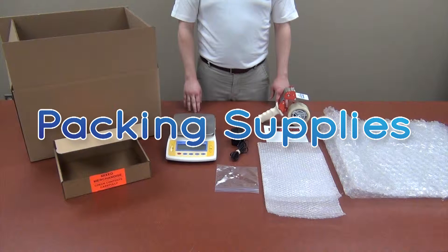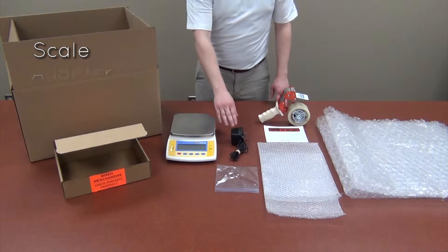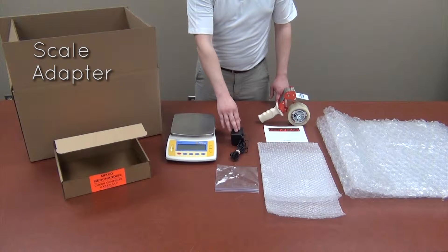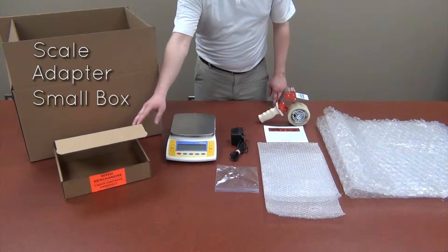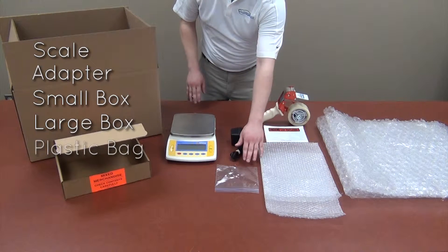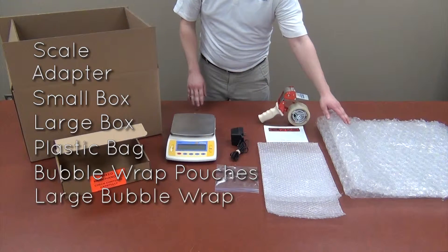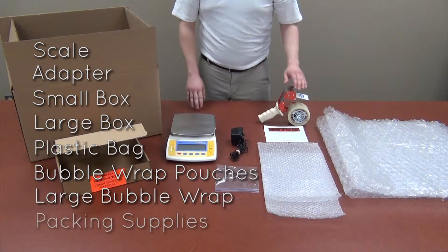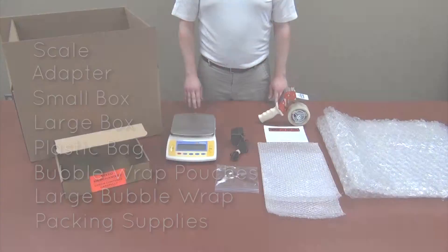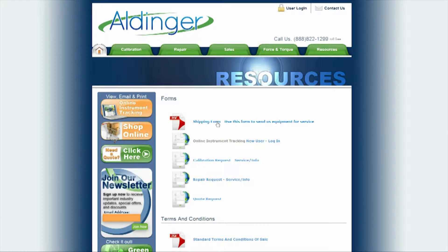To begin packing your scale, you will need the following items: your scale, your scale's power adapter, a small box, a large box, a plastic bag, bubble wrap pouches, large bubble wrap, and other packing supplies such as tape and packing peanuts. You will also need to fill out and print a service form located on the resources page of our website.